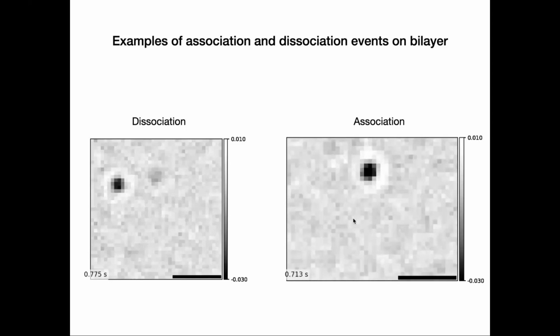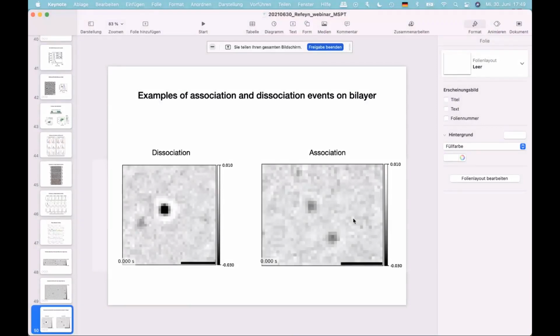These events have been really rare to observe in their case, and software-wise, we are not able to quantify or detect these events yet, because the tracking program would probably stop the trajectory and start a new particle. So we would have to adjust the image processing and particle analysis software to account for these events.